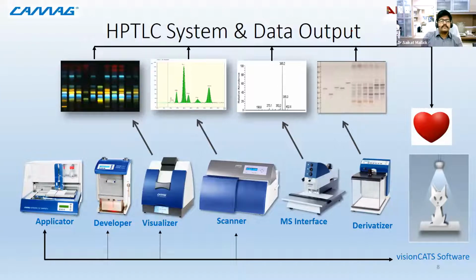So it is based on a principle of spray, and it just sprays the reagent onto the plate, and then the reagent transfer onto the plate happens. So if the molecule is non-visible or non-UV active, you can simply spray a chemical compound and make it a derivative after the process of derivatization. And then the derivatives are similarly appearing compounds that you will see after that reaction has finished. And instead of using a chemical compound, if you use a bacterial solution, then you can use it for bioautography study. But normally a dipping technique is much more preferable because it is easily handled for the bacterial studies. I will also come to that part when we move into the bioautography part.